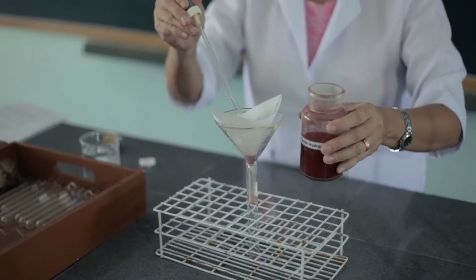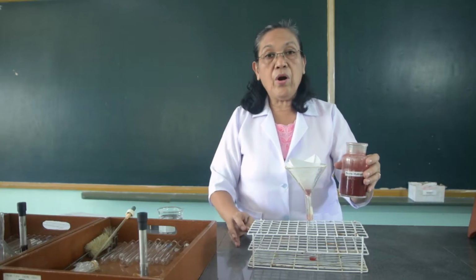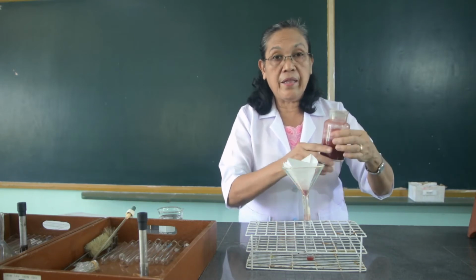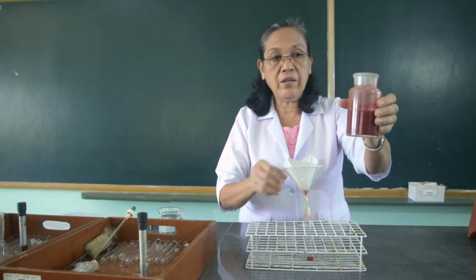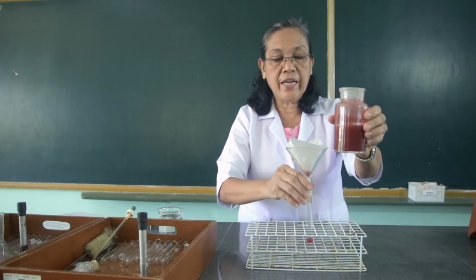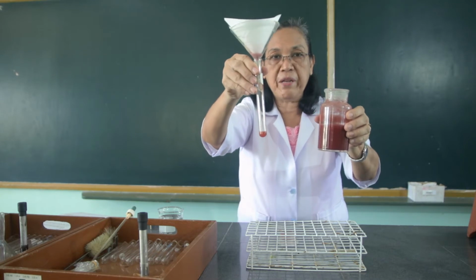Now, what I would like you to observe is the original color of the ferric hydroxide before it is being filtered and after the ferric hydroxide has been filtered.